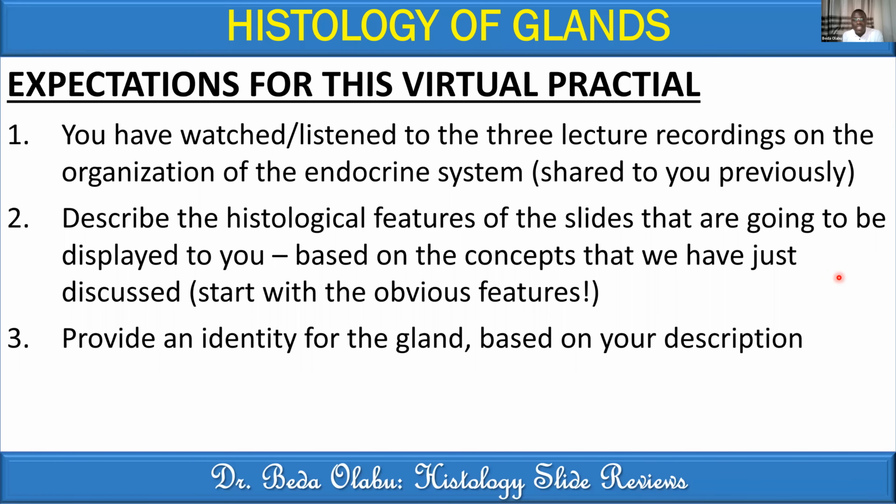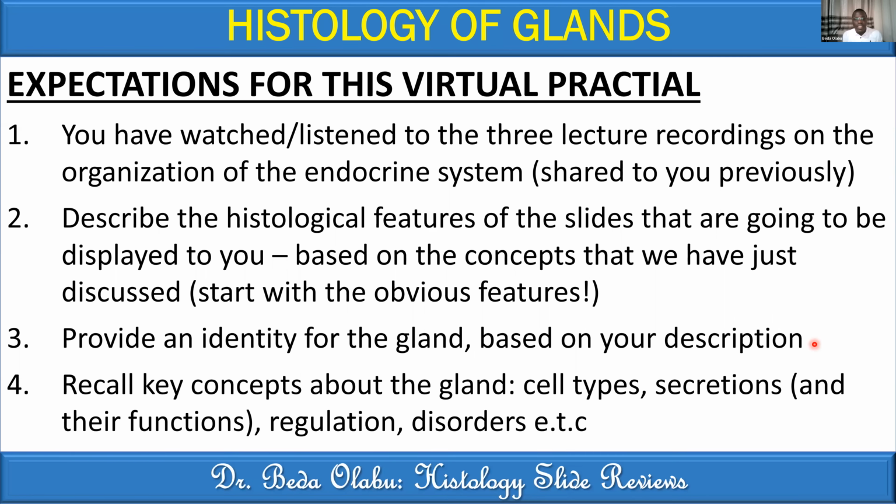After you've given that description, then our next agenda is to identify that particular slide, and that will be based on the description. And finally, I expect you to be able to recall from the lecture something unique about that particular gland that I'll have displayed to you.